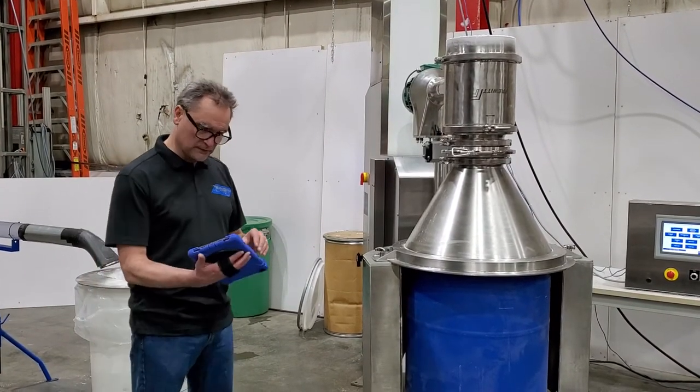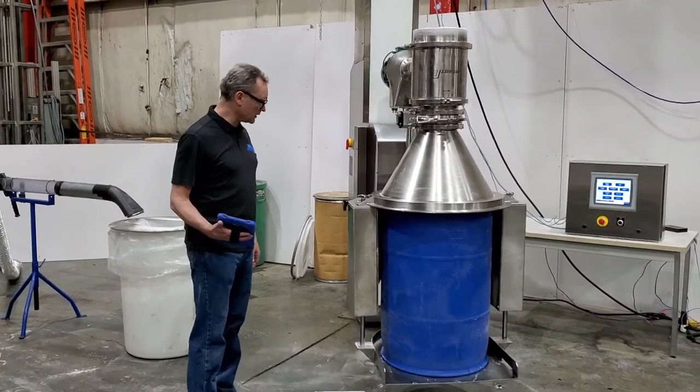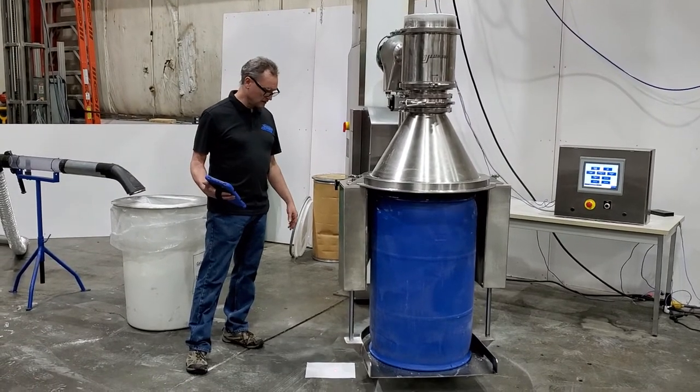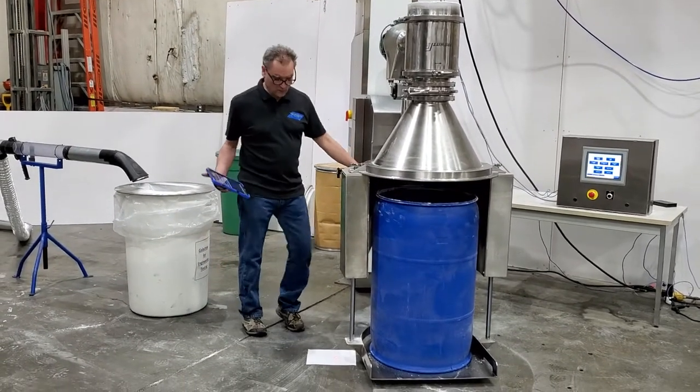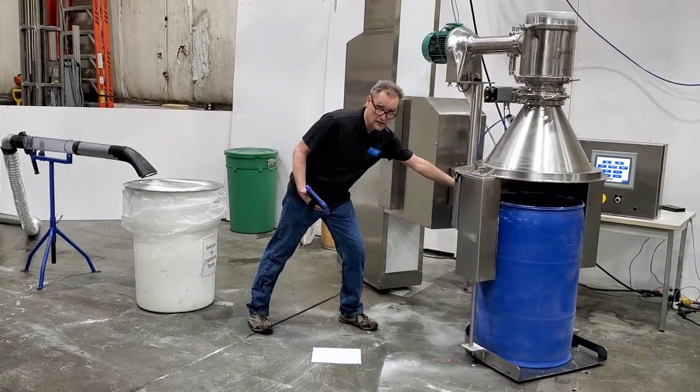So I'm going to unclamp the drum. I'm going to give a demonstration of the positioning system. When the machine's not in use, we can simply just push it out of the way.